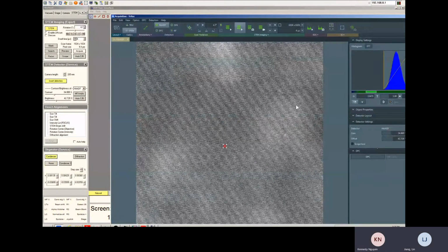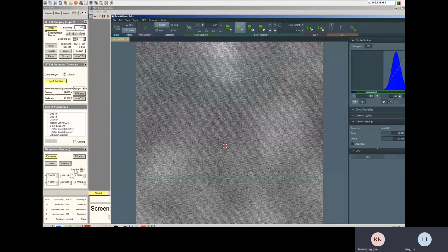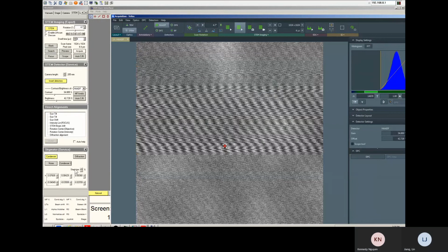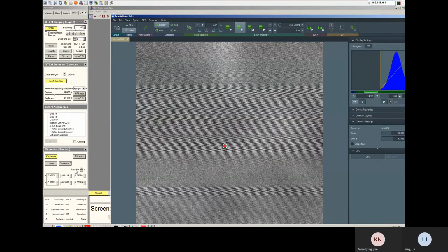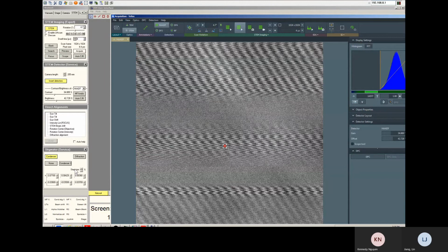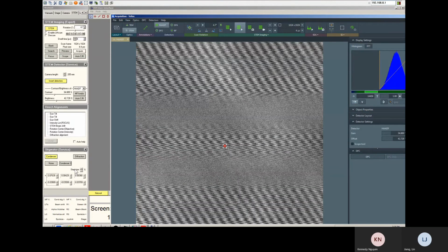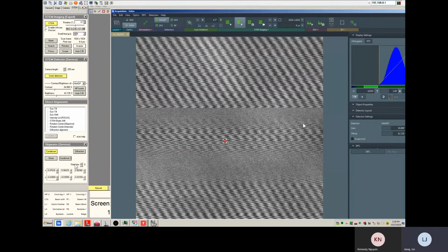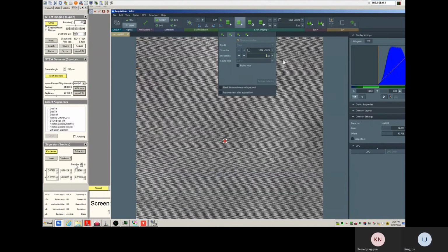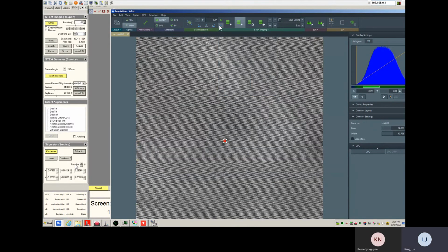and then we can go adjust condenser. A lot of vibrating there. So bring the little focus around there.